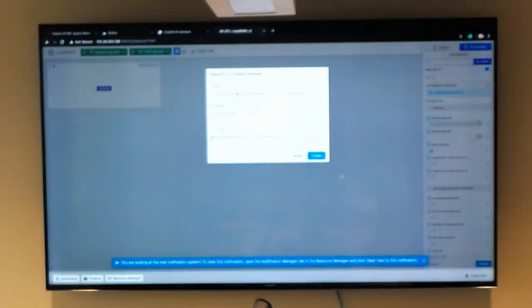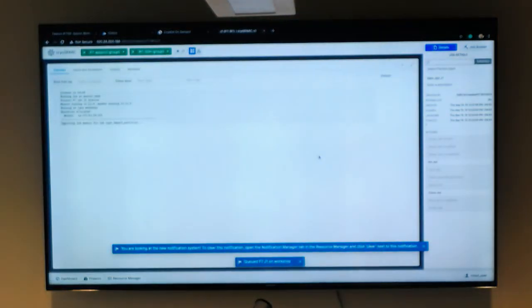So you don't necessarily have to add something else. In this particular case, we're working on, is it the workshop node? Workshop node. So when you submit to the queue, make sure we're working in the workshop node, and create it. And when you're running jobs, you'll see it go along, and this is quite fast in the sense of importing.